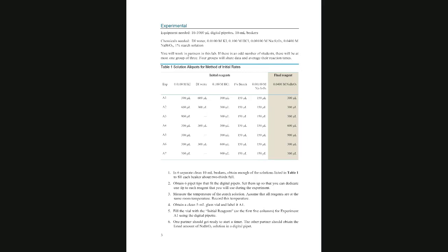Okay, exactly, Michael. So this is basically the table. So the first thing that you will have to do is, they are providing you experimental data, right? What are they saying? That for experiment 1, you need to use this table. Let's do experiment 1 first, and then you'll know how to do all the rest.